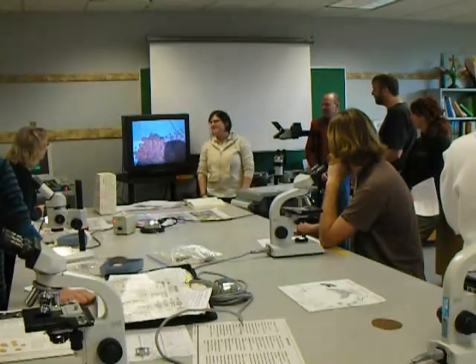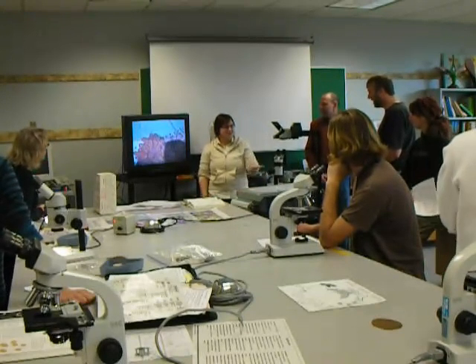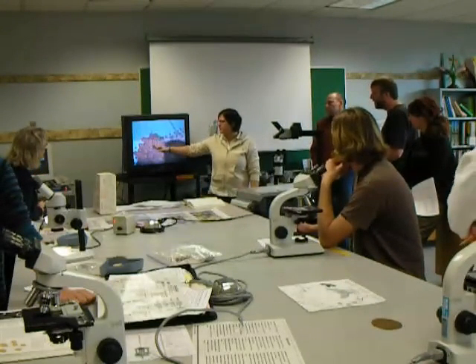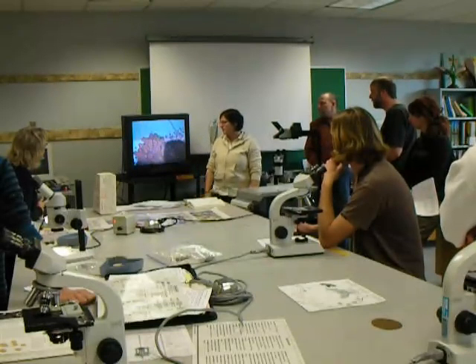It looks really neat. A little plug for Asarum sedatum. But yeah, it was really neat, and the stain works really well to see it undergoing meiosis.